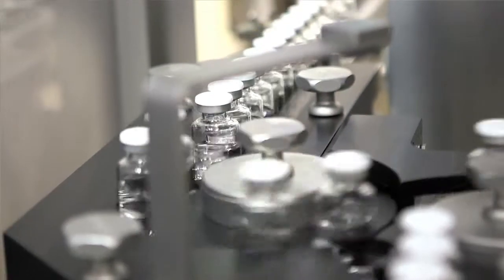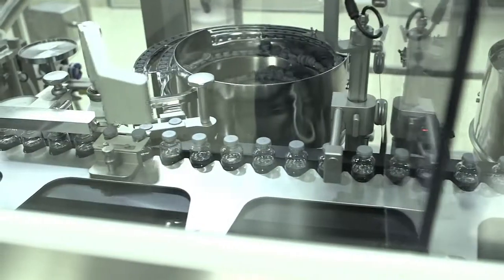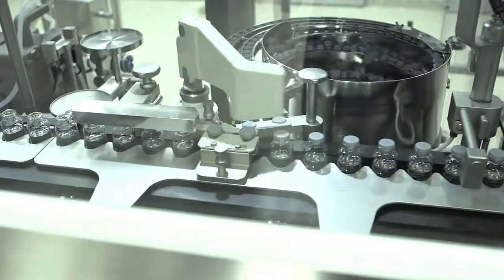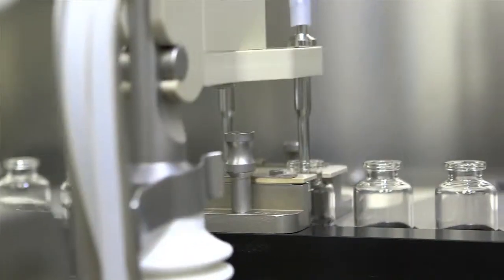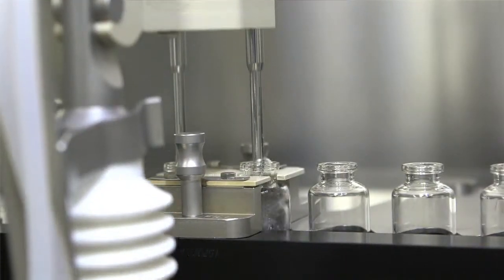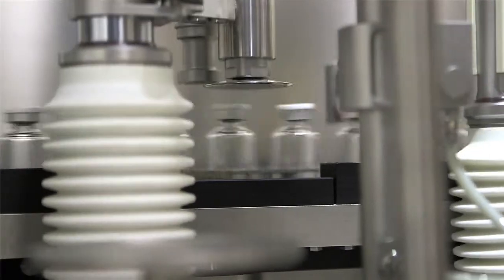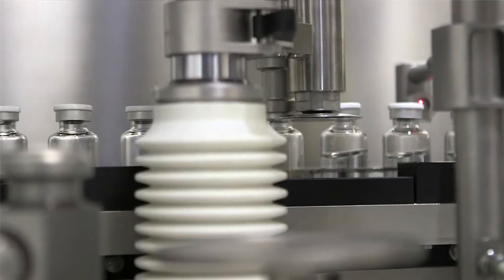We've purchased a MAC from an Italian manufacturer called IMA. The MAC stands for a Modular Aseptic Compartmentalized Filler. This consists of a vial washer, a depyrogenation tunnel, and a Grade A filling zone, where we have the capability to fill vials 2 ml up through 100 ml.